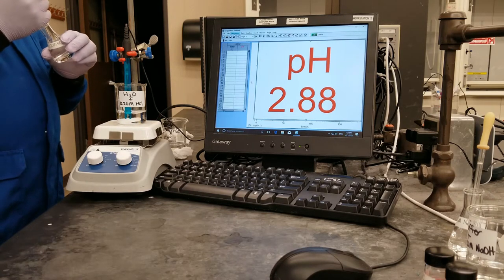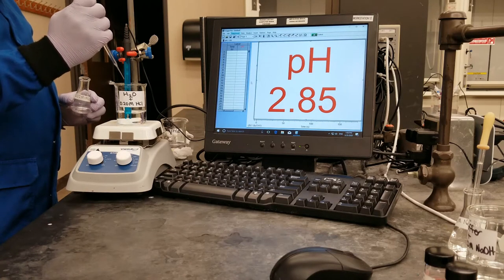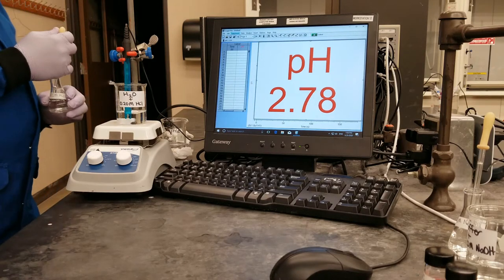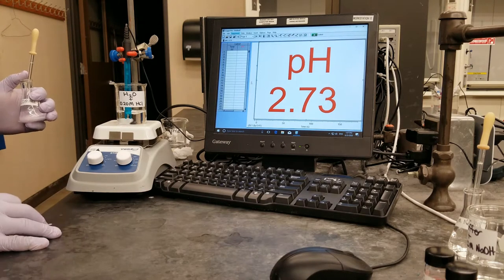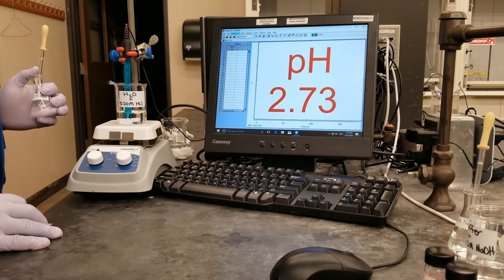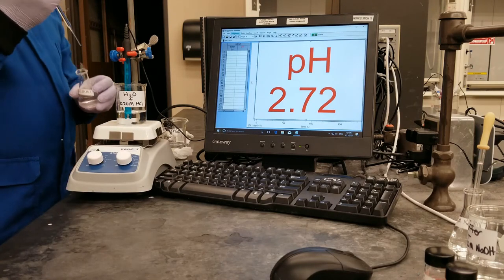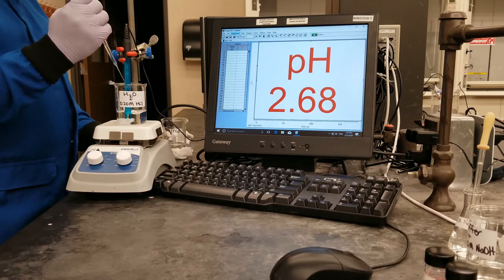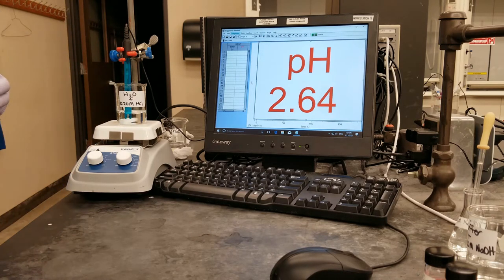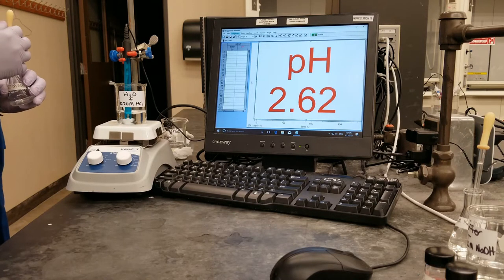I will go ahead to add the next 10 drops and wait for the pH probe to stabilize. And that gives us a pH of 2.72. I will go ahead to add the next 10 drops — that makes 40 drops altogether — and wait for the pH probe to stabilize. And that gives us a pH of 2.62.